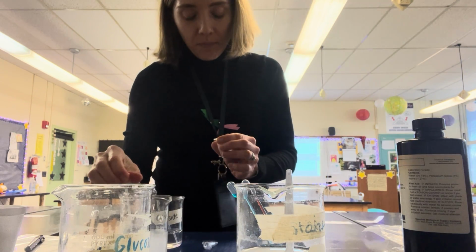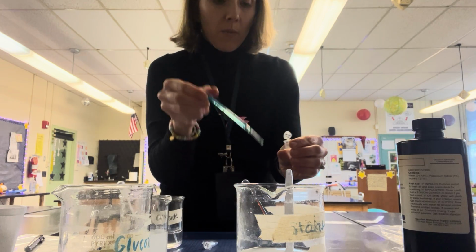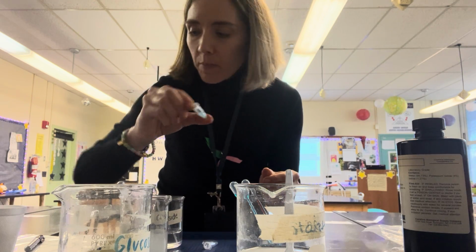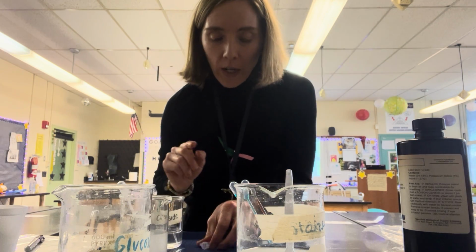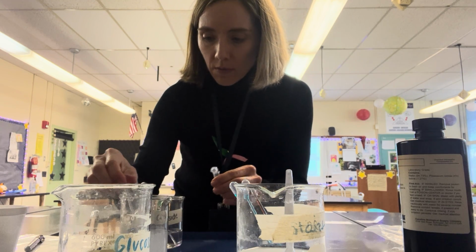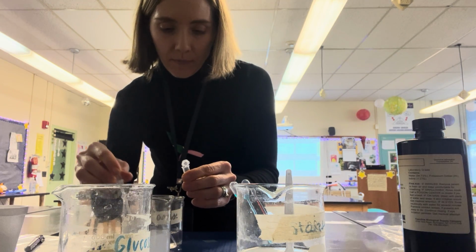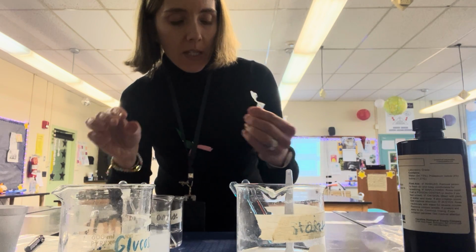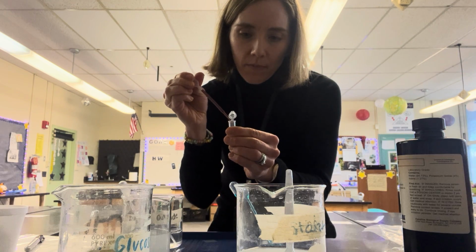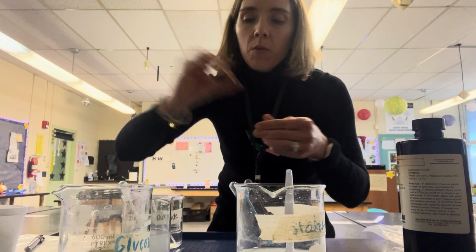So here's my inside. Again, let's check for our Benedict's first. So I'm going to use my blue Benedict's to look for glucose. It needs to go for a little hot tub. Wait on that. My inside, looking for starch. So inside iodine. Ooh, I think I'm seeing something happen here. Ooh, this is changing color.